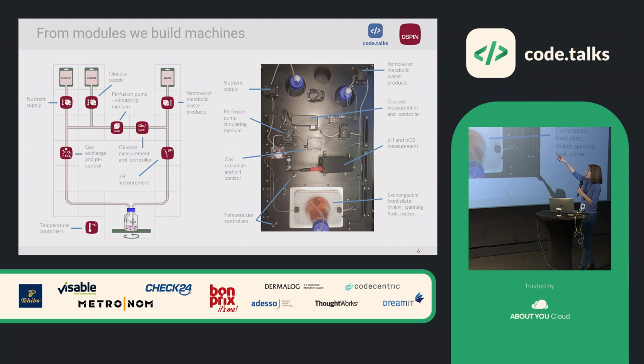If you take the image here, they are still playing around with tubing, because they are still trying to figure out what they need, right? So they think, maybe I move this tubing there, or if the tubing's a bit shorter, maybe it works better. For them, it's good that they still have this manual trying out, because automating something that you don't really know what you want to do doesn't work in this context.